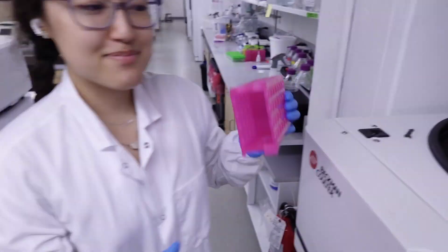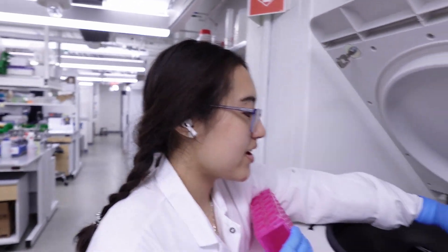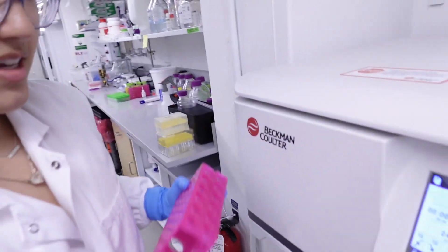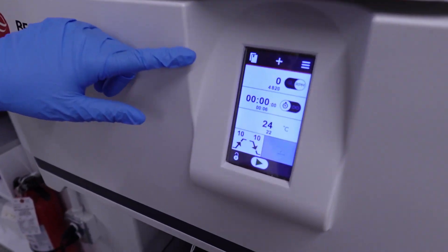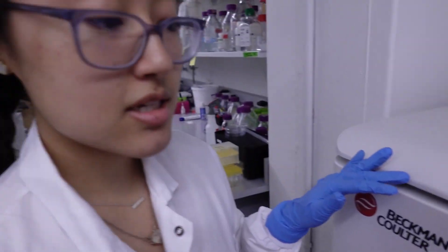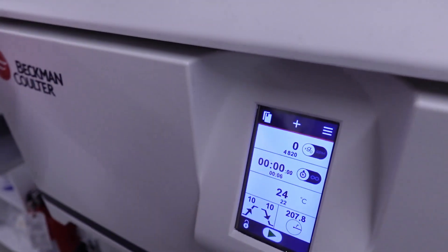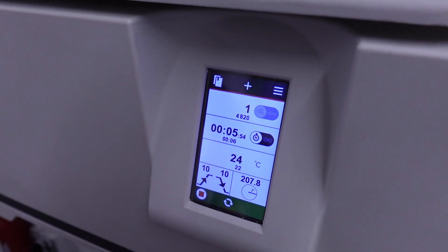According to Justin, our PI, as long as we kind of align them and make sure everything looks symmetrical. So we're going to do 4820G and we're going to do it for six minutes. So this G versus RPM — RPM is just rotations per minute. The issue with this metric is that it varies from machine to machine, whereas the G metric is a standardized measurement that will stay the same across every machine. So it's usually preferable to use G in protocols because that can replicate across various machines. We'll keep it for six minutes at room temperature.